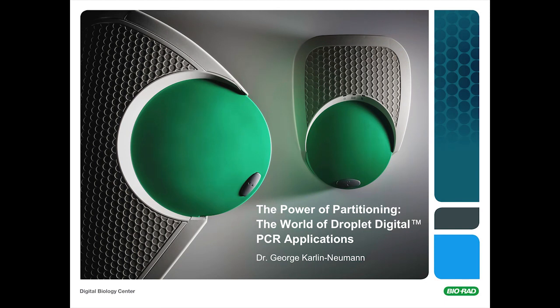George? Thanks, Mohini, and welcome to everyone who is joining us today to learn about some of the many remarkable ways in which Droplet Digital PCR can enhance your applications. What I'd like to do is to start by describing what is digital PCR to those who are not yet familiar with it, and then I'll proceed to describe how Droplet Digital PCR, or as I'll refer to it, ddPCR, is performed on Bio-Rad's QX100 and recently launched QX200 Droplet Digital PCR systems.